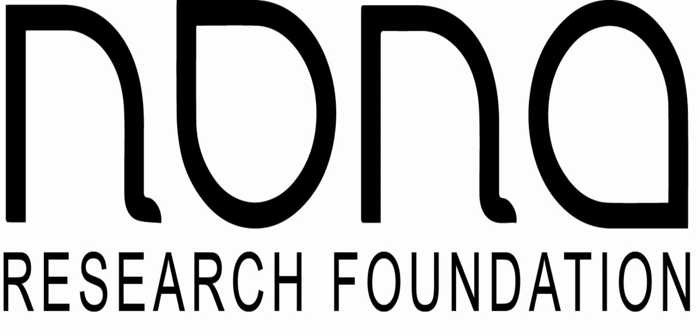With that in thought, maybe there needs to be a LIMS standard out there, or maybe another sort of nonprofit group who can make that standard and continue to build on it, where we have things like SBOL for doing some of the actual standards for graphics that get generated, and lots of others, SBML, tons of standards groups, but I haven't seen one for LIMS, and it might be that we need to make one.